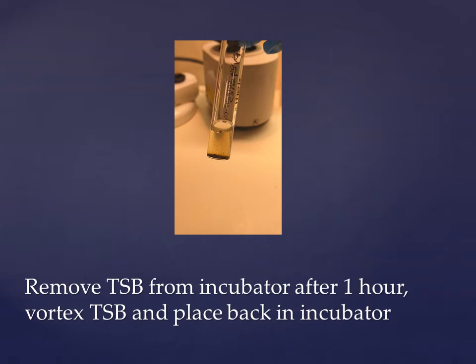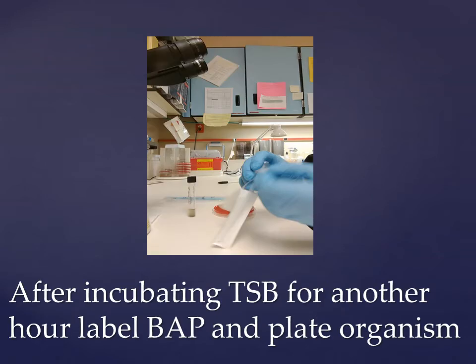We're going to pull it out of the incubator in about an hour. As you can see, it's starting to break up, but we're going to take it and vortex it for another 5 seconds to break it up even further and put it back into the incubator.